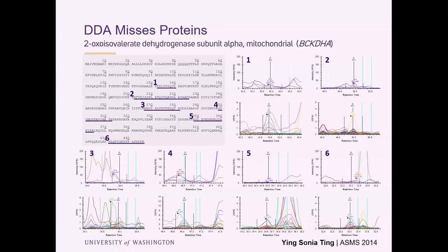So, was the DIA data acquired multiplexed or not? This was just five mass-to-charge windows. It was not multiplexed. This was actually before we had the ability to demultiplex the entire spectrum. So at that point, we were only able to demultiplex things in Skyline until the last year or so.